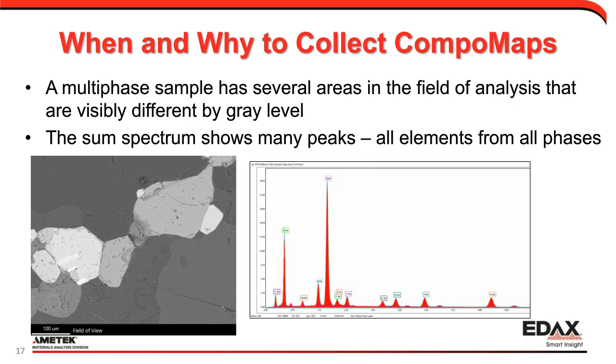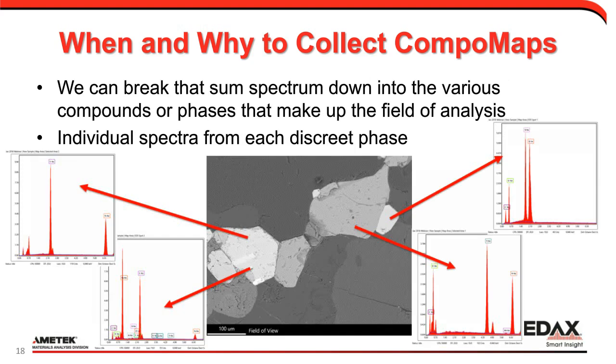And when we do this, we combine all the peaks together. Now, all of those peaks together really don't make much sense at all because we have, well, quite a bit of elements there. Not necessarily all in combination, but it gives us a quick view of what we might expect in our sample. And this was collected in just a few seconds. So these days with detectors, the speed of detectors, we could usually collect, I don't know, around 10 or 20 seconds is my normal spectrum collection time. And we could even see the small peaks.